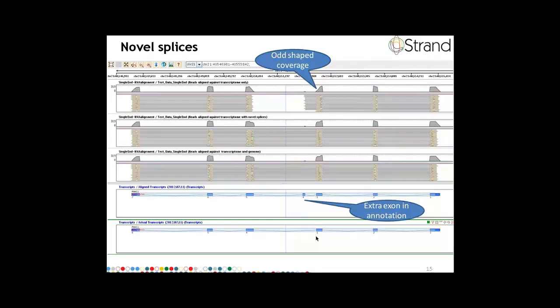Now consider the reads which arise from the transcript shown at the bottom track. Suppose we have reads which span this particular intron. In other words, part of the read comes from exon number 3 and part of the read comes from exon number 4. When we try to align those reads against the transcriptome, they will not match because the transcriptome that we will be aligning against has the form where there is a novel exon in between. So these reads will not match, and that is indicated by the empty space that we see out here.